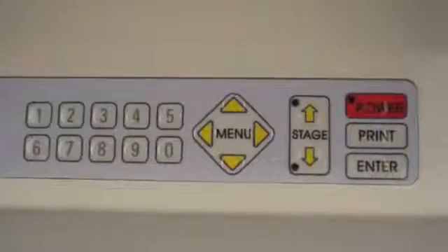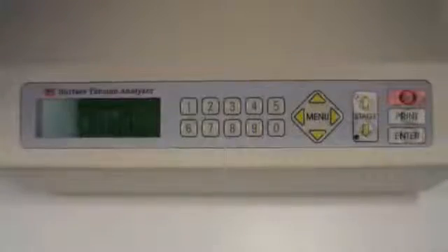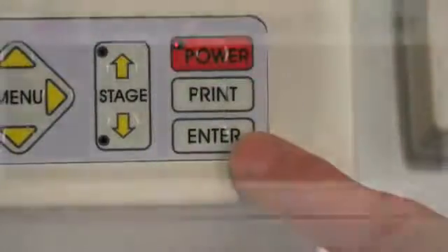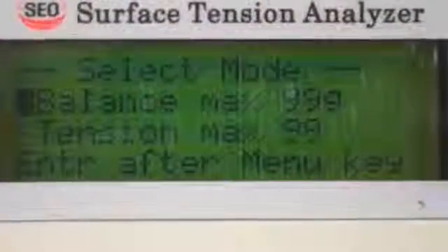The simple digital keypad layout makes operating the DST-60 easy. To begin testing, the operator simply presses ENTER on the keyboard and then follows the command prompts.